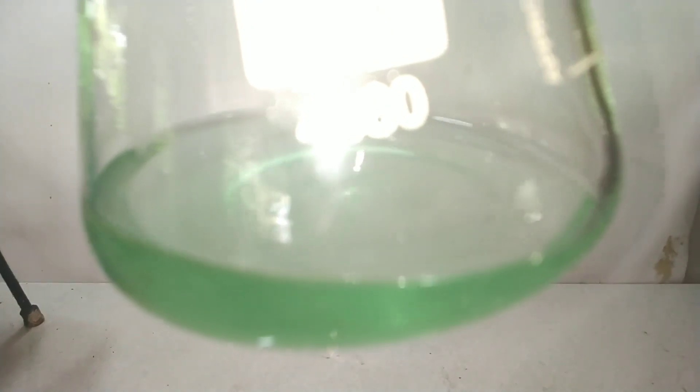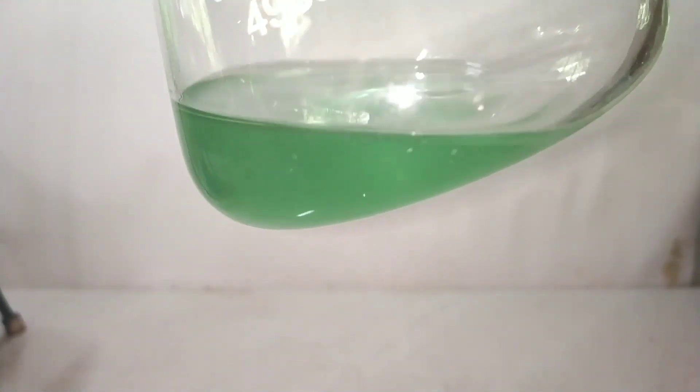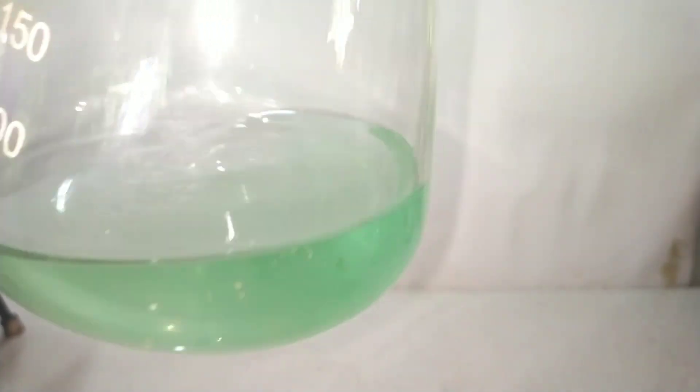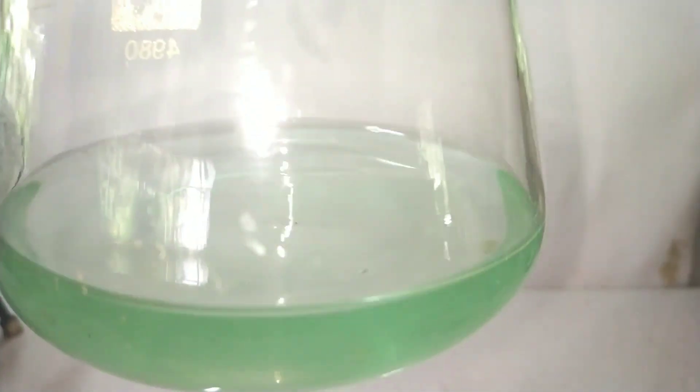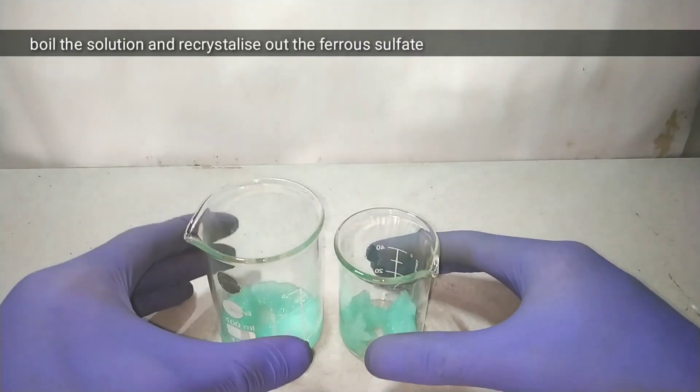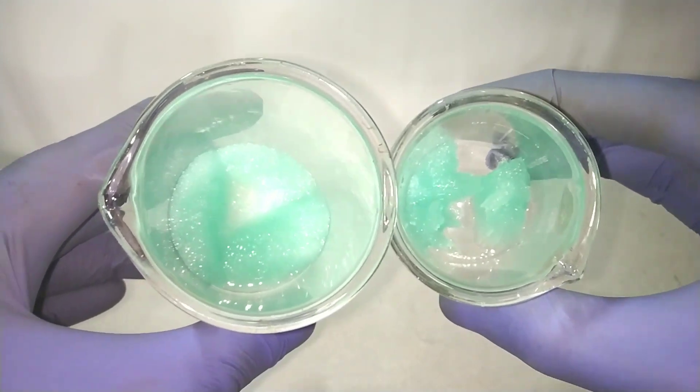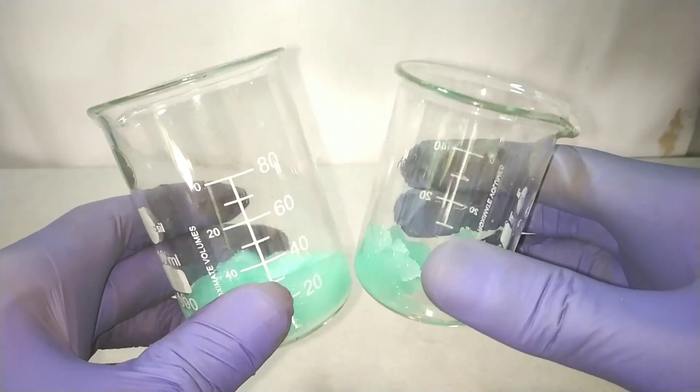The color of the filtrate is green. Iron salt being a transition metal salt gives colored compounds due to partially filled D sub shell. Then I boiled the solution and recrystallized the ferrous sulfate from it. You can see the crystals of ferrous sulfate with its light green color.